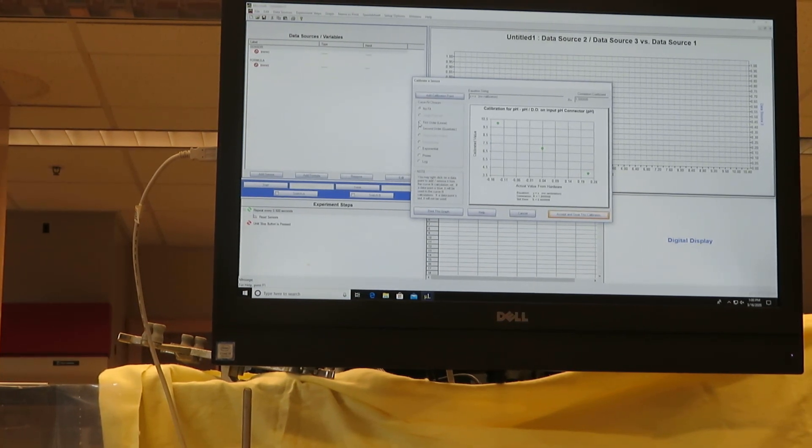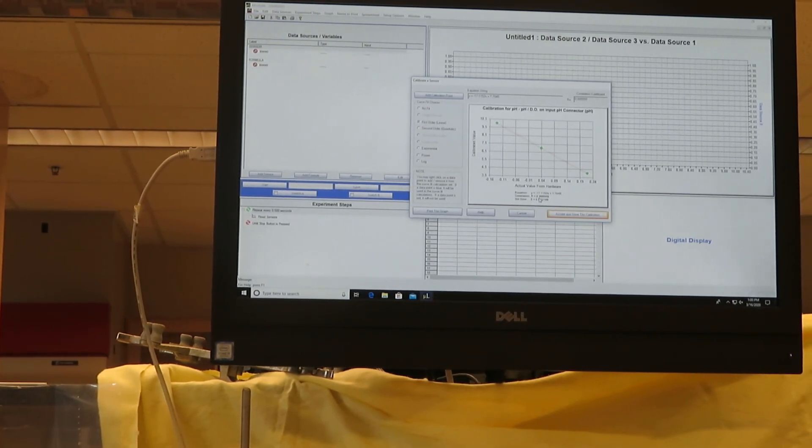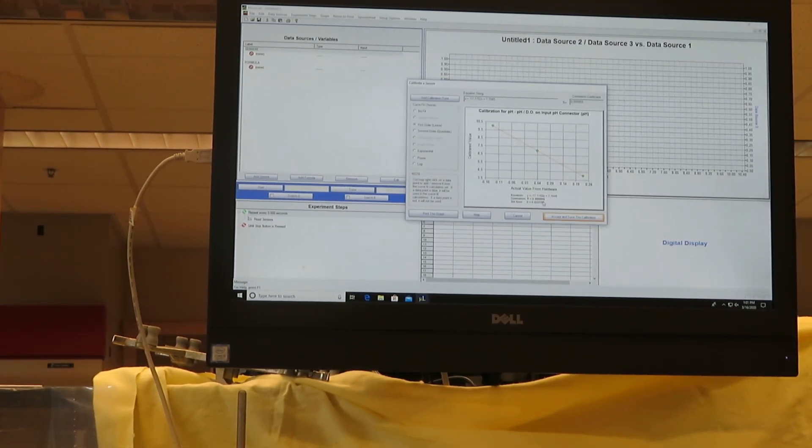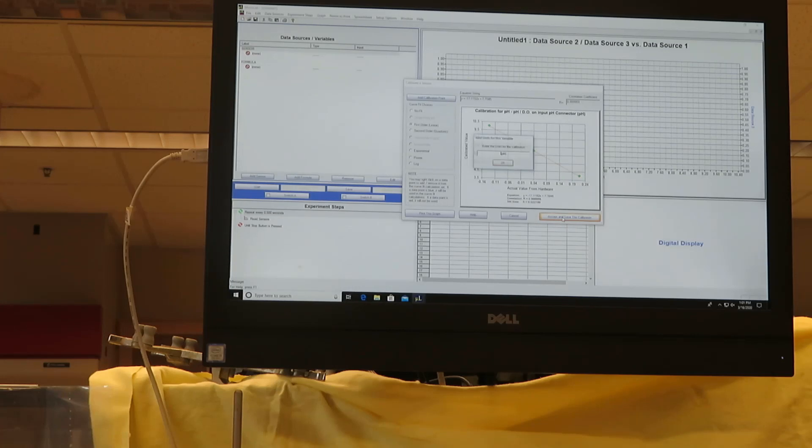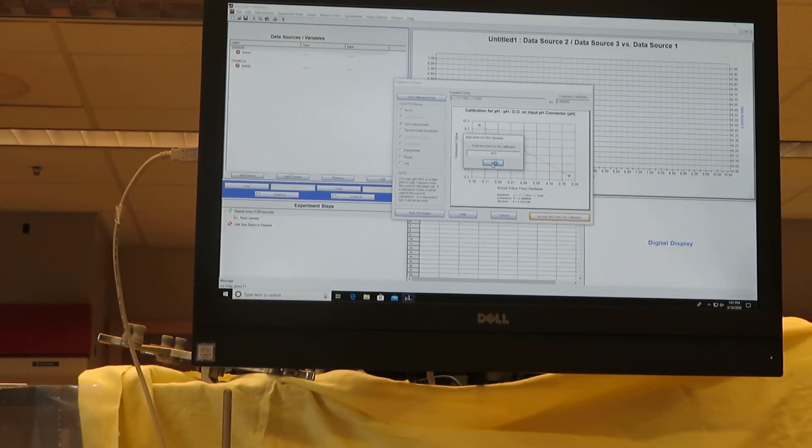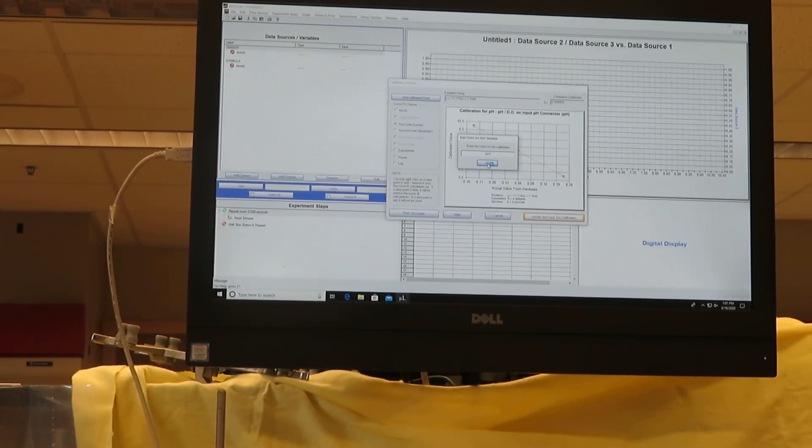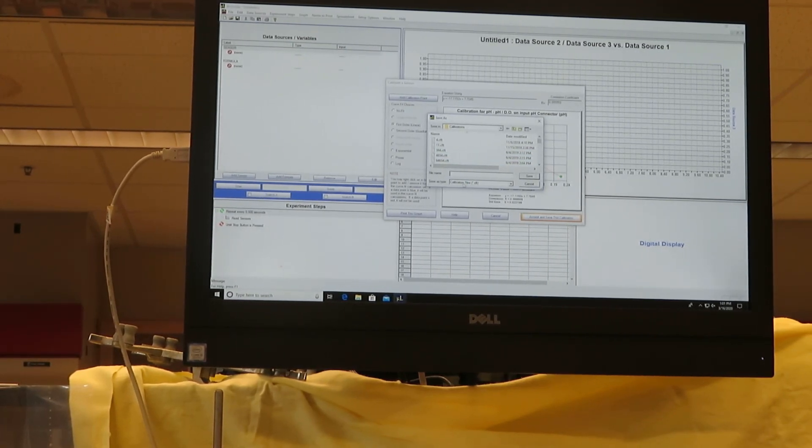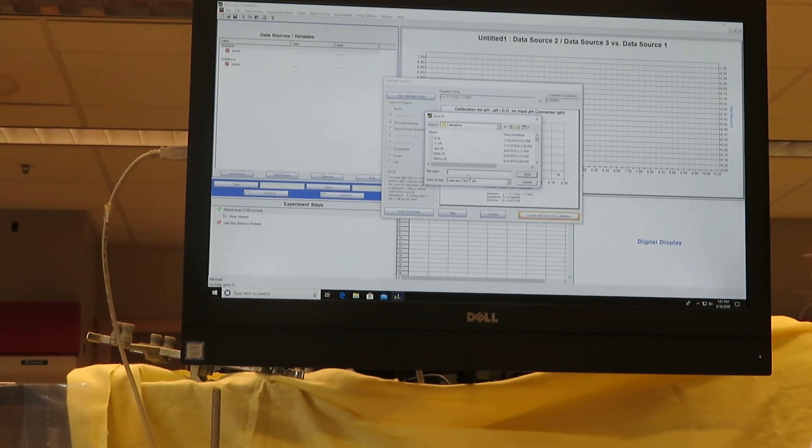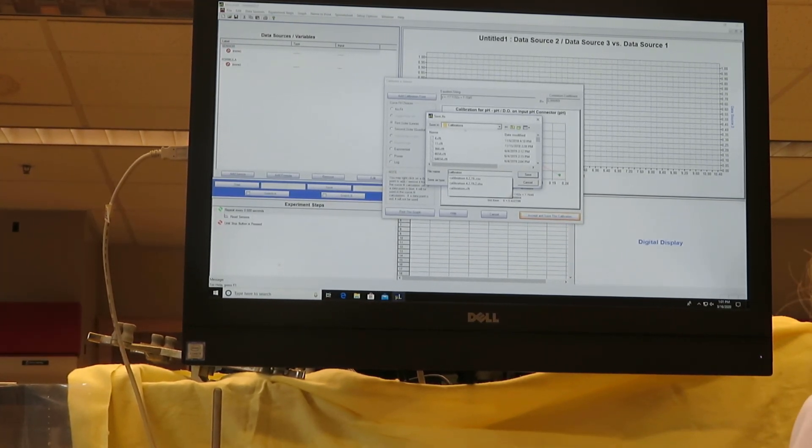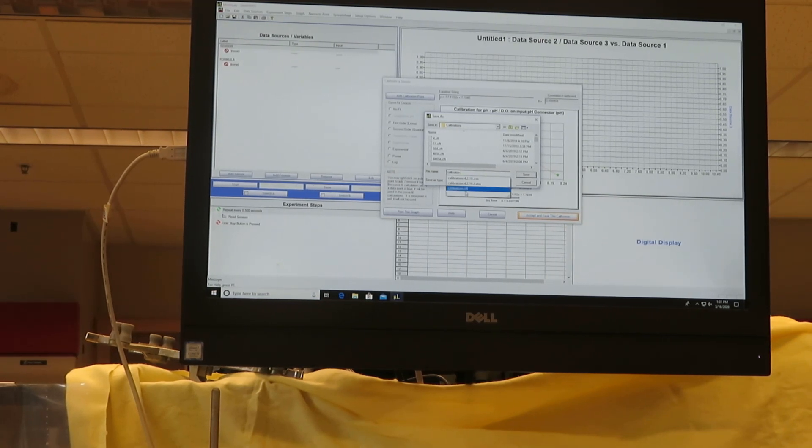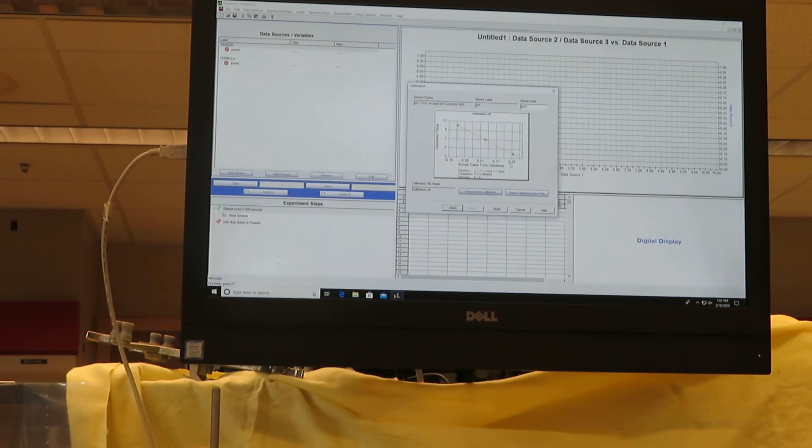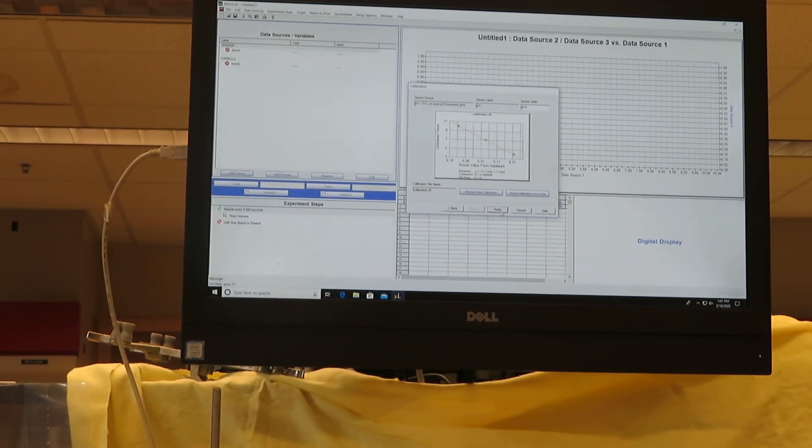Now I will make a first order linear fit, and you notice it's beautiful. The correlation coefficient is 0.999. I will accept and save this calibration, and the units for this variable will be pH. I will replace the old file. I am now finished.